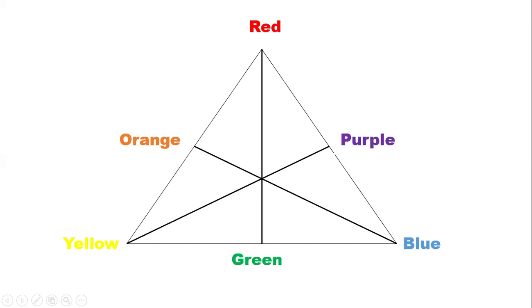If we look at this diagram, it tries to explain the principle behind how some substances absorb colored solution at certain wavelengths and selectively absorb, with the resultant color being transmitted. When light passes through a colored solution, certain wavelengths of light are selectively absorbed, and the resultant color is due to the light which is transmitted.